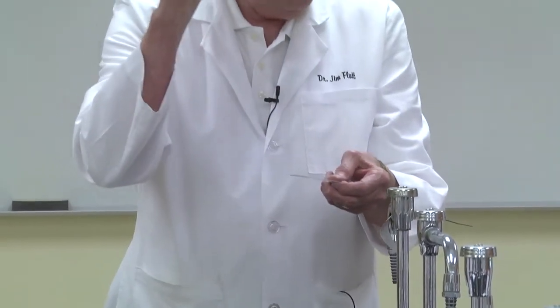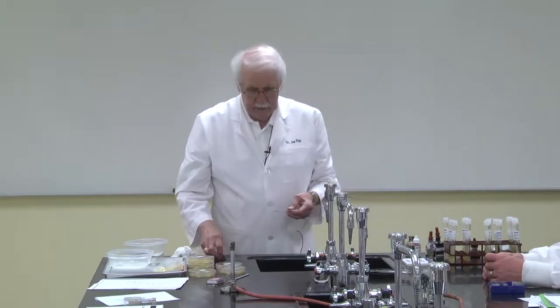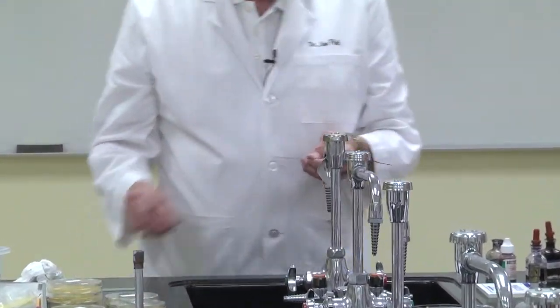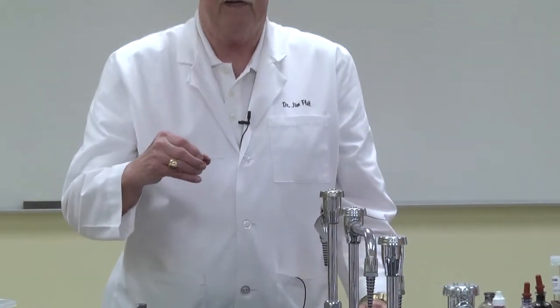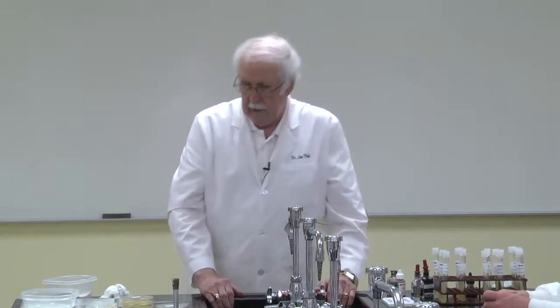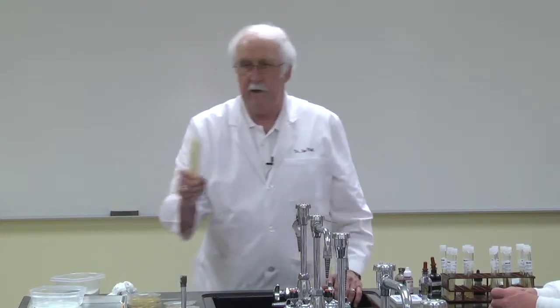Then we throw this away. I have a trash can here. We'll always be careful with these stains. These are highly corrosive. We take a second slide now, we put it in front of that, and we push that forward and bring it back, and we let that air dry. And with that, we can determine the size, the shape, and the arrangement. Normally, we would be using the Bunsen burners on this to kill the bacteria, since we can use those over and over again, but this is very convenient here.